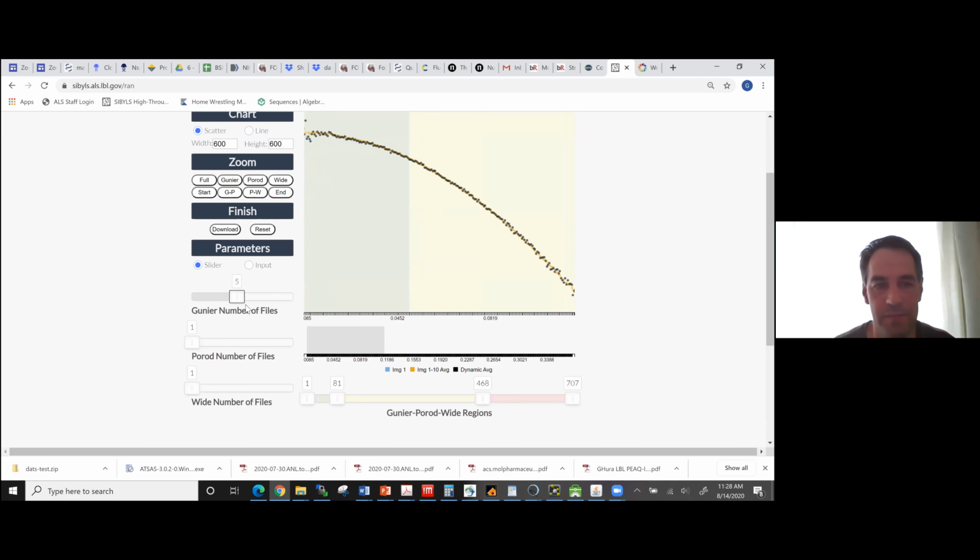You can add frames. And again, there are 3 colors here you can't see very well: blue is the original, orange is all frames integrated together, and the darker one is the current set of frames. Here, pretty much you can use all frames. And of course, I'm just showing the first 10 because I had some download issues. But yeah, certainly play with that as well.